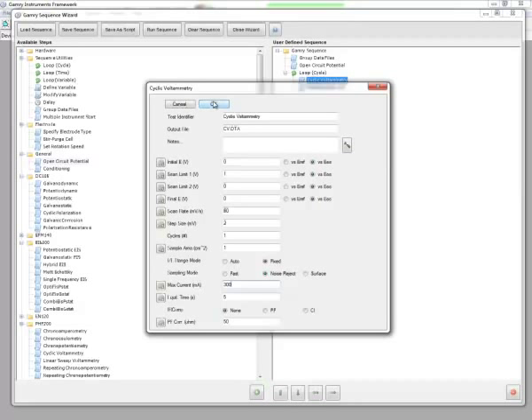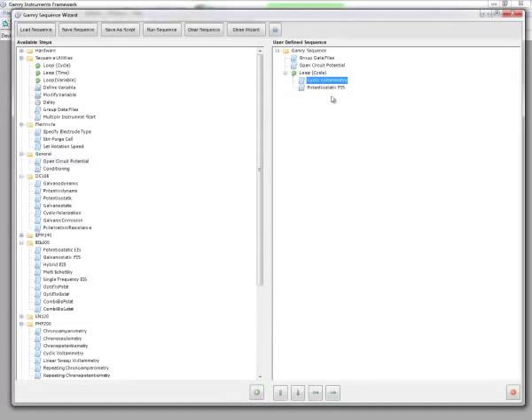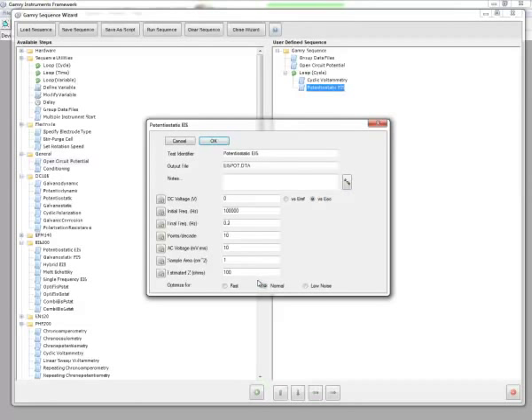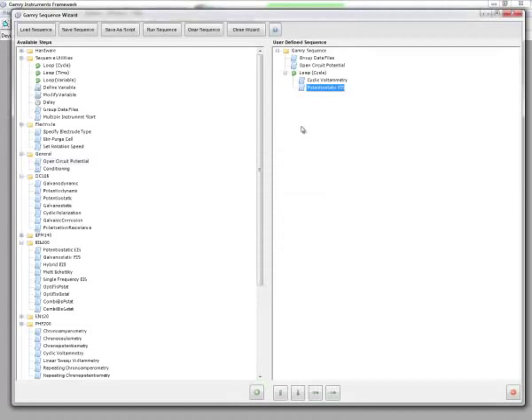So now I'm going to click OK, and then I'm going to click on the potentiostatic EIS also. And you would set this experiment up just like you would normally. I click OK.